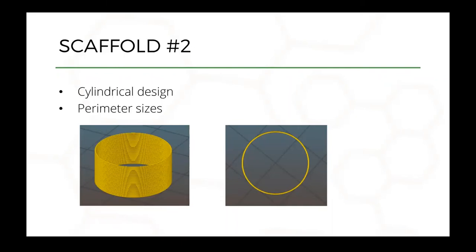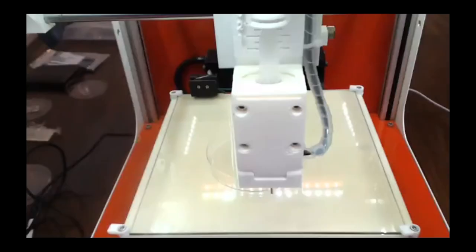The settings for the thinner needle size will be different, but that's something we will discuss in future webinars in terms of adjusting needle sizes and different types of materials. So this will be the second kind of scaffold that we will be printing shortly. I will now turn my screen over to Oliver, and he will show you the software. So I will make Oliver the host.